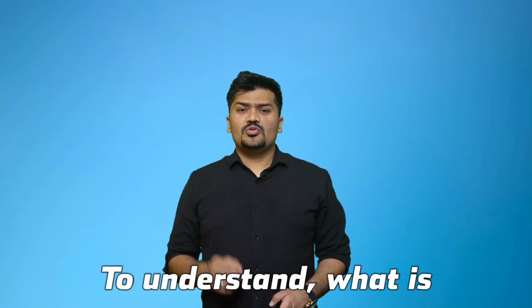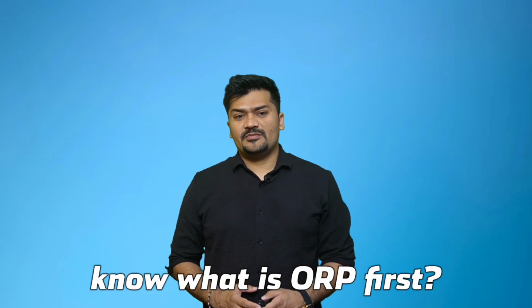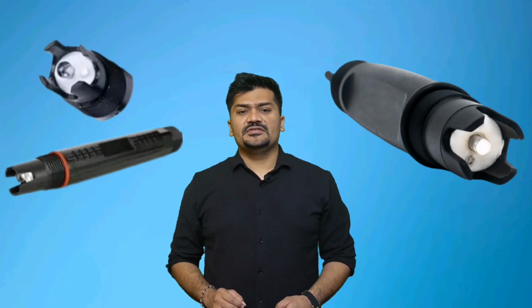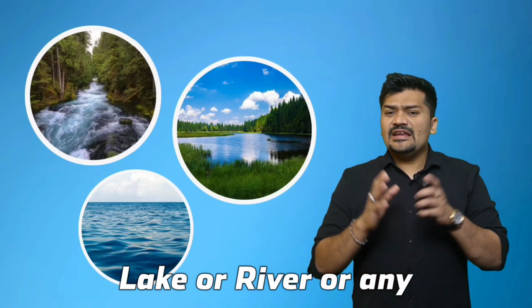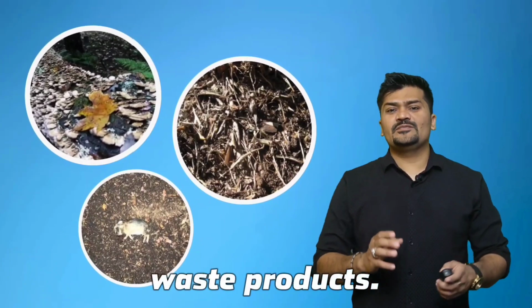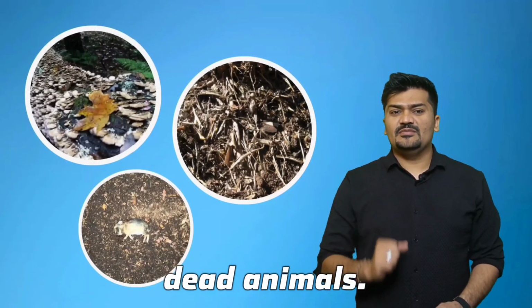Now let's understand what is ORP sensor. To understand what is ORP sensor, we need to know what is ORP first. ORP is oxidation reduction potential. It measures the ability of a lake or river or any type of water to cleanse itself or break down waste products such as contaminants and dead plants and animals.